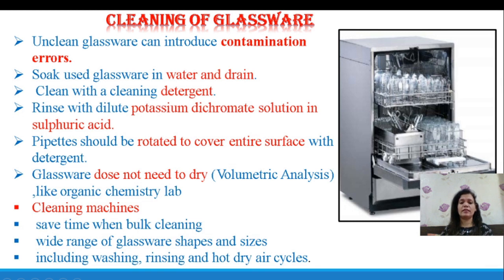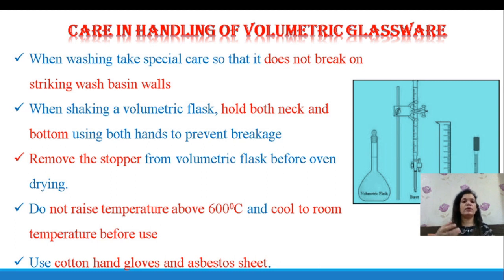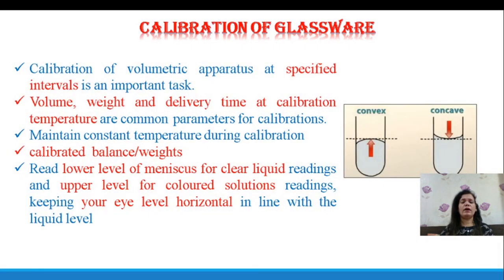While handling volumetric glassware during washing, it should not touch or strike the wash basin — handle with care. When shaking the volumetric flask, hold it at the neck and the bottom to prevent breakage. Remove the stopper of the volumetric flask before drying in an oven. Do not raise the oven temperature above 600 degrees Celsius, and cool the apparatus to room temperature before use. Use cotton hand gloves and an asbestos sheet when removing apparatus from the oven.